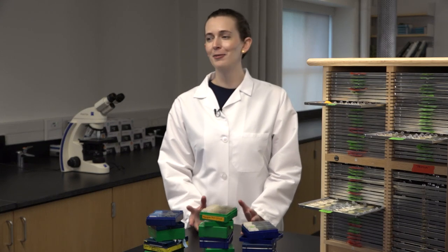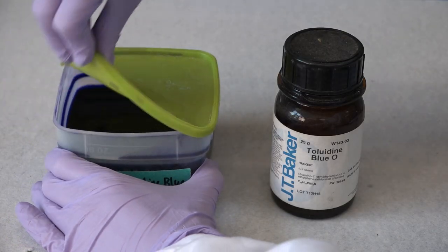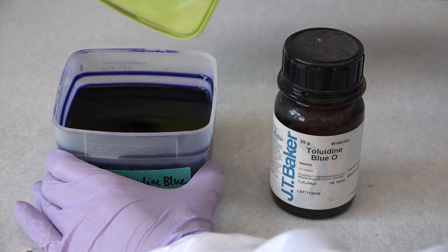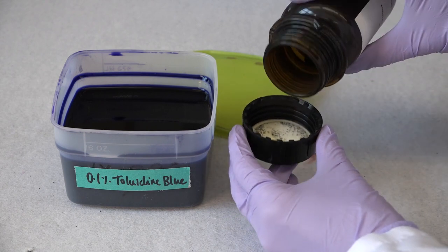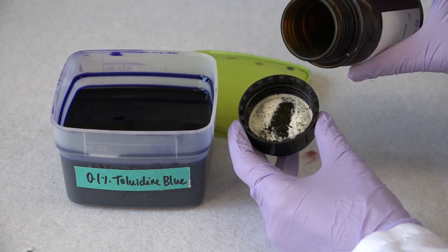Staining. The science of tissue staining is vast and wonderful. You can choose stains that will highlight certain tissue and cell types and enhance your ability to observe microscopic features. Today we'll be using a stain called toluidine blue, which will stain our plant tissue blue, mostly blue. It does have the ability to stain different cell types some different colors, so we'll see how our sections turn out.